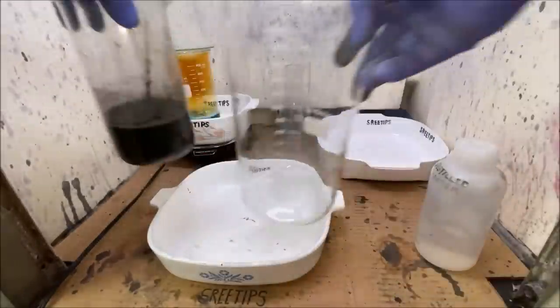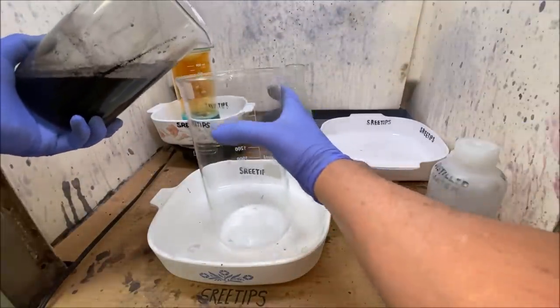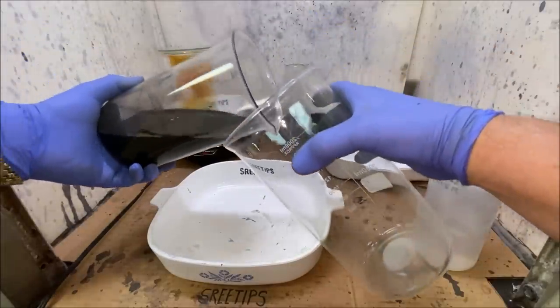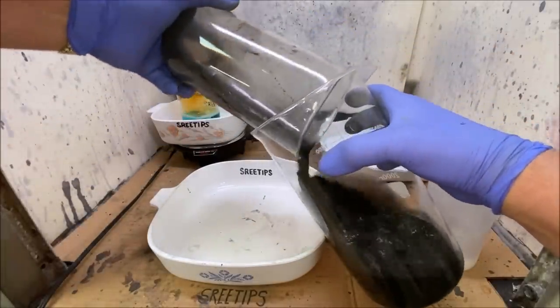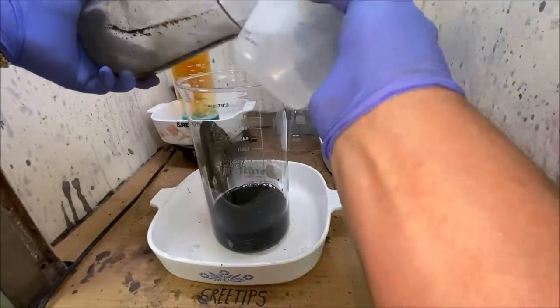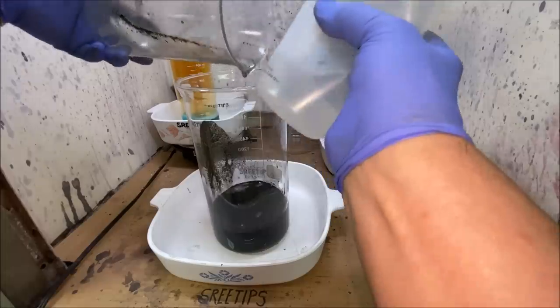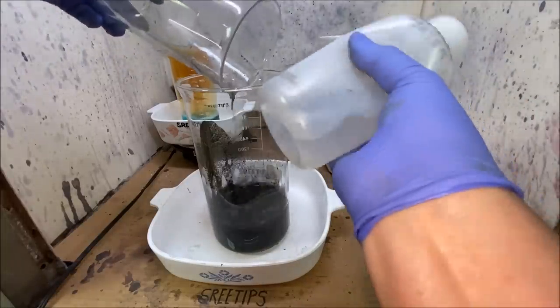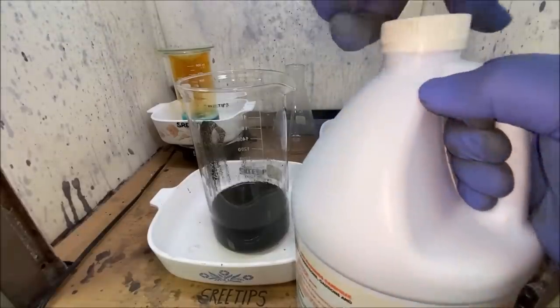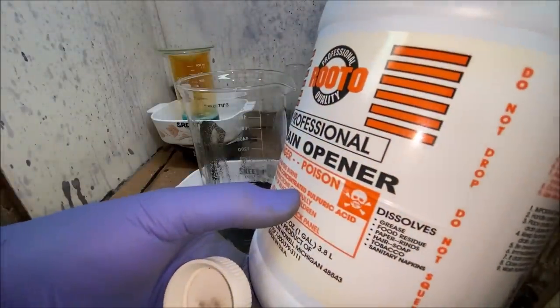This is too much material to try to do the reaction in this small beaker. So now we'll have to transfer everything into this larger 2-liter beaker. Otherwise, it'll probably boil over when we hit it with the Piranha solution. Now here we go. We're going to put some sulfuric acid in again. Sulfuric acid.